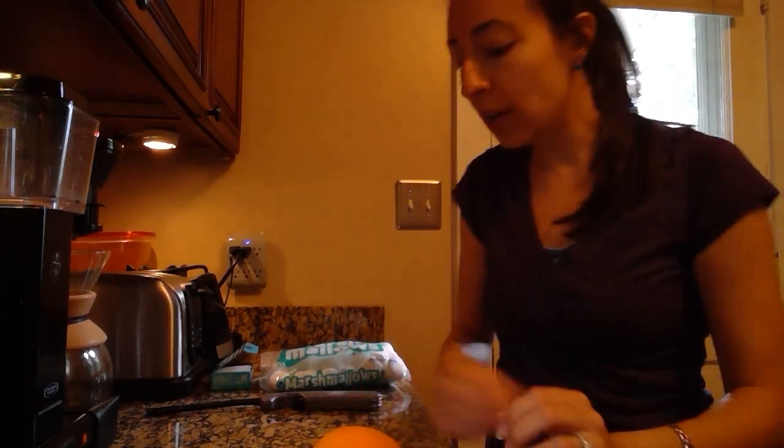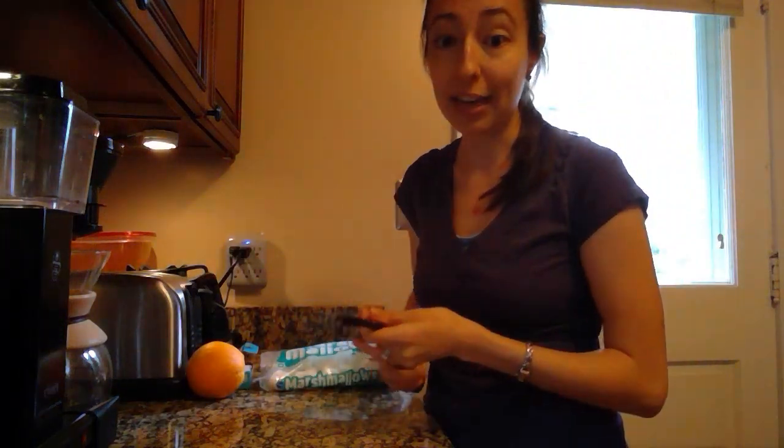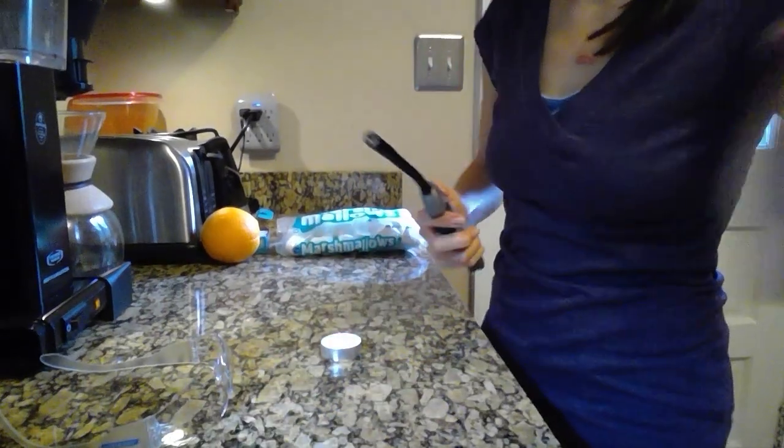Now for step two, we're actually going to get into our experimentation. So you'll need your little tea candle from your lab kit, and you're going to go ahead and light it. And again, make sure your space is nice and clear and careful. And I'm going to bring my camera down a little bit so you can see.